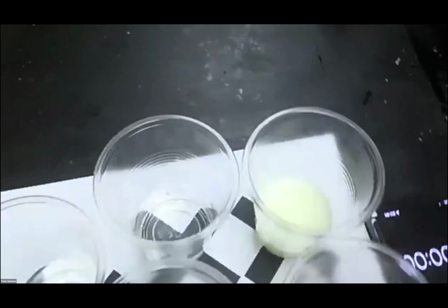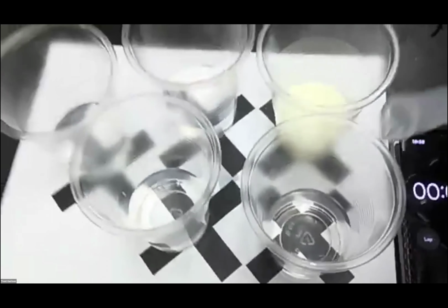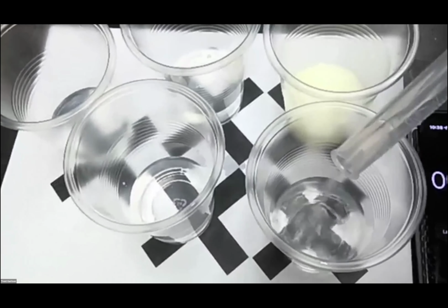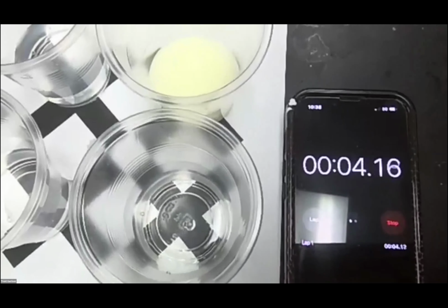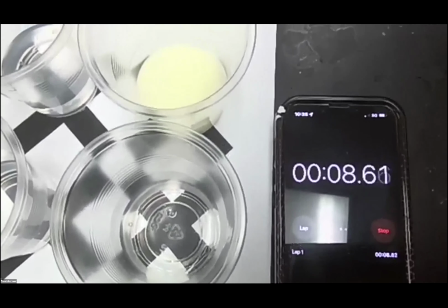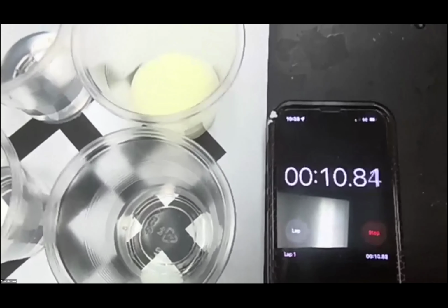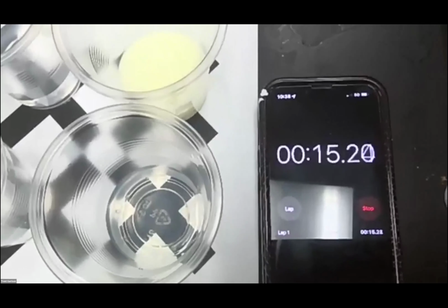Okay, so we're ready. I have cleared out my timer, and I have poured up 5 milliliters again. So this time I'm going to dump it in a second container with less concentration, and I will start my timer. So I pour it in and I start my timer. So my timer is running, and we will observe to see how long it takes for this reaction to occur. We know we won't have any kind of reaction until at least 27 seconds, where it completely obscures the vision.